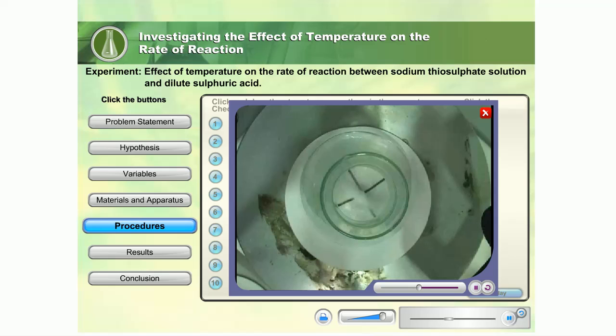Place the white paper with the X mark on the magnetic stirrer. Place the conical flask on the white paper.